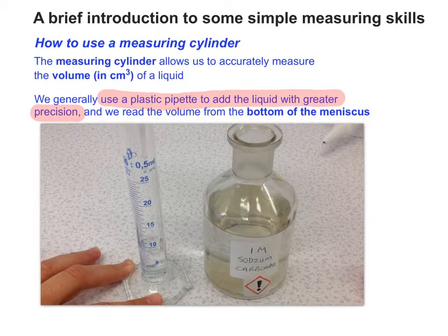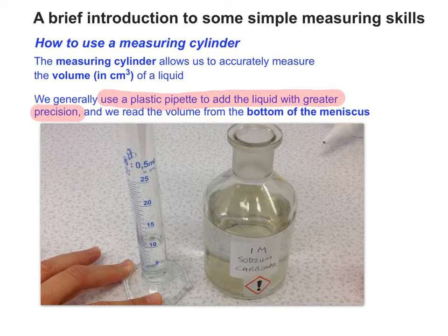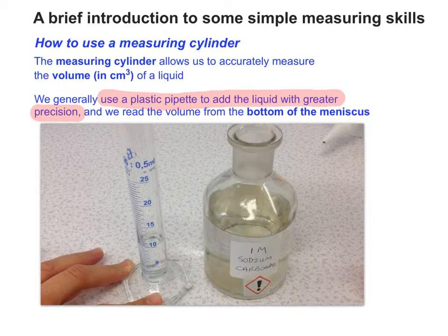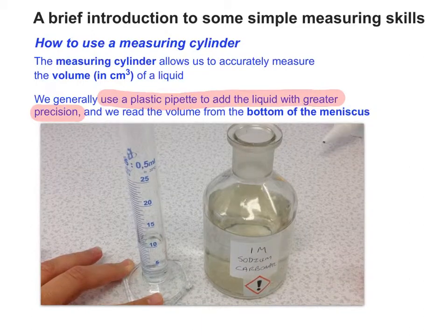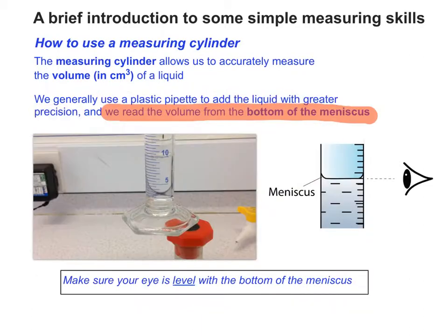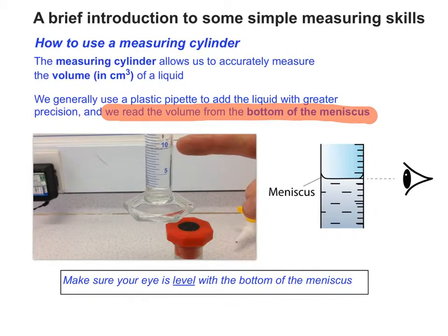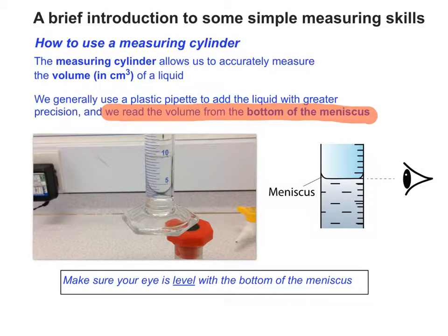I'm going to very carefully just add one drop at a time now, and keep my eye level with the meniscus until I'm exactly up to the 10 line. The really important thing to be aware of here is that your eye is level with the bottom of the meniscus, like I'm pointing at my finger, and it's indicated in the diagram as well.